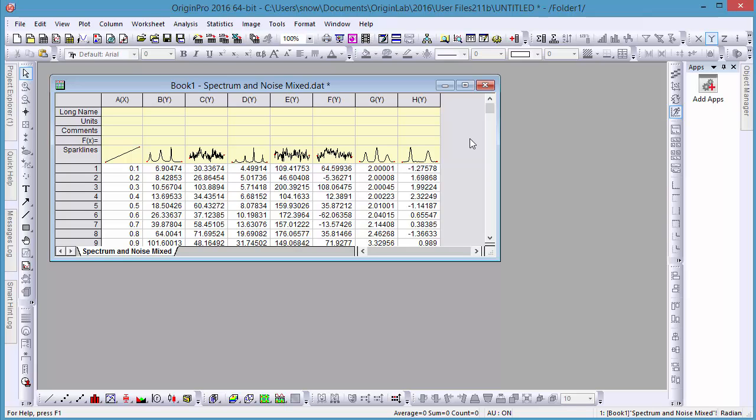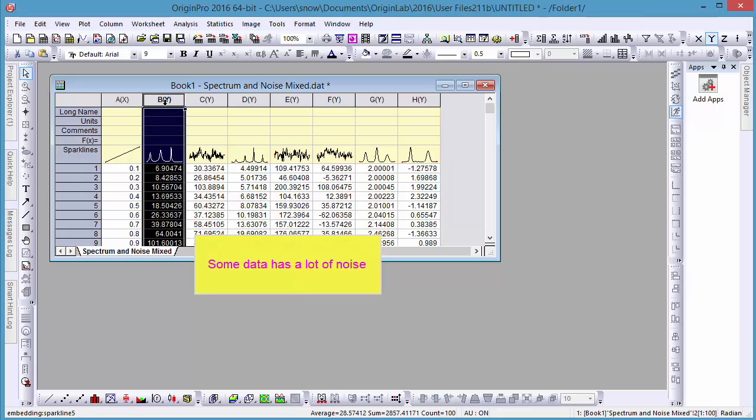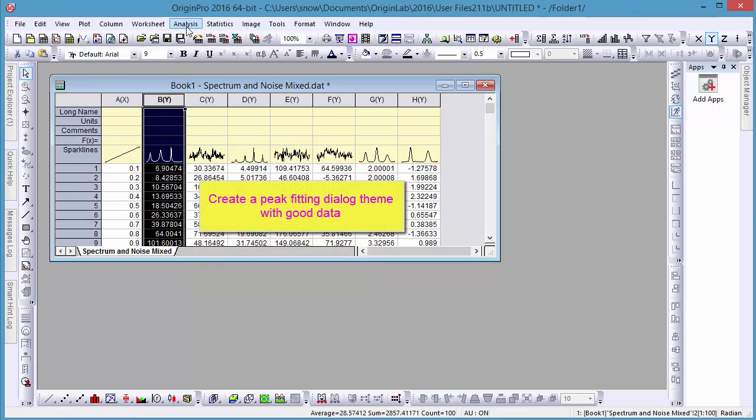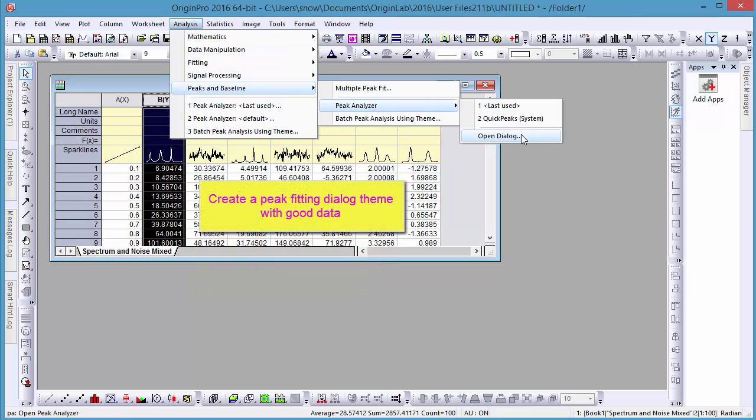In our next example, we have a worksheet of data with a significant amount of noise. In order to better understand what this data shows, let's create a dialog theme for the Peak Analyzer tool.